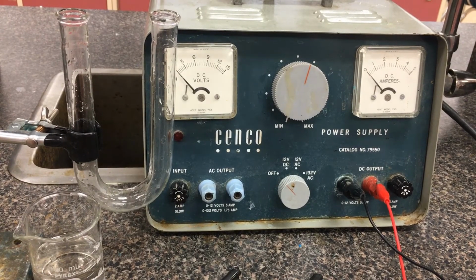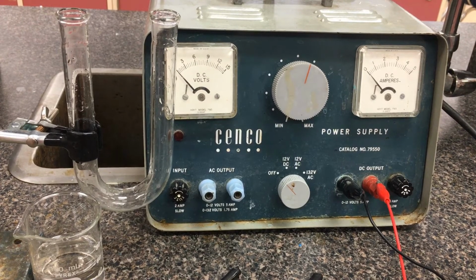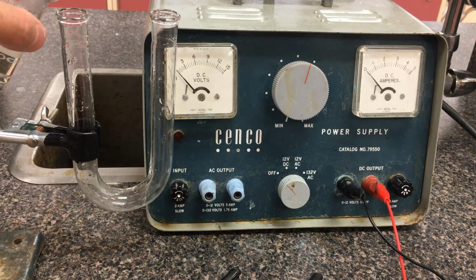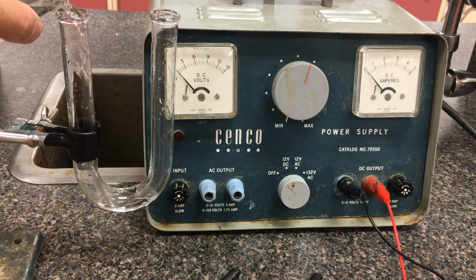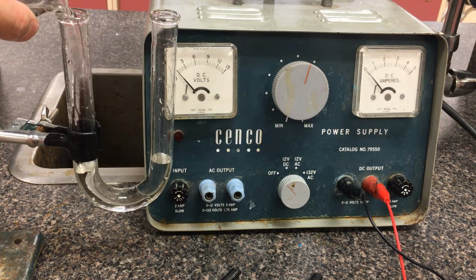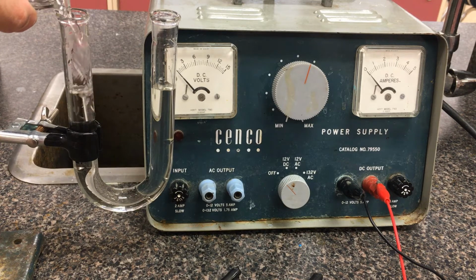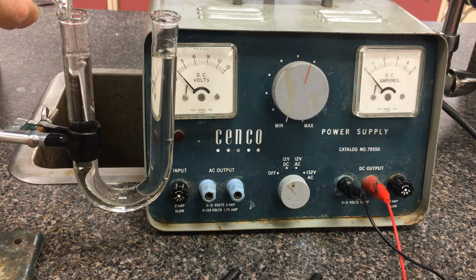All right, so this is part 3 of our electrolysis lab. This time the solution we're electrolyzing is a 1 molar solution of potassium iodide. We've added already some phenolphthalein inside here. You'll notice that this one is remaining colorless, so we know that it's still on the neutral end towards the acidic side. I'm just going to fill up this U-tube again. Remember the U-tube is actually connected, so this is technically just one beaker. We're just using the U-tube for demo purposes, just to make sure our leads can be far enough apart. So that's just 1 molar potassium iodide.